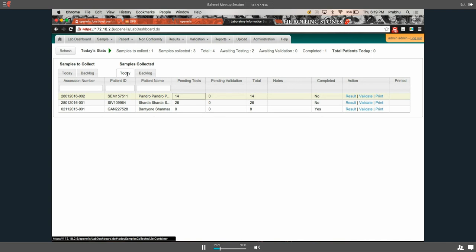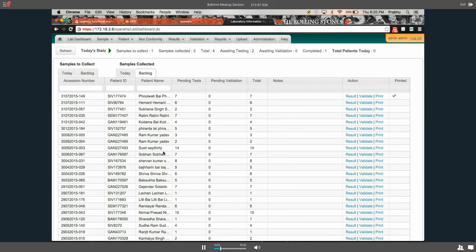Tim had put a question on the chat where he was asking whether the samples collected section shows all the outstanding samples, including the ones from today and earlier, and how do you define the backlog? Is backlog everything that is not today? Yeah, backlog is everything that is not today. So basically, the only filter that we have is for today. That's the way we've designed it right now. The samples that are collected today will be shown in this queue, and everything behind this will be shown in the backlog queue. I think we can see up to 1,000 entries right now.